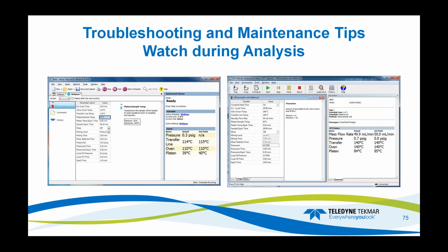Watching during analysis. Now I know some people may say, well, Mr. Roger told me that during the HT3 or Versa run I have to watch it during the analysis. What I'm suggesting here is to kind of keep an eye on it. In my years of laboratory experience, I can walk in the lab and sometimes hear something that's not quite right. As you walk past the instrument through the day, do things look right? Does it sound right? Are the sounds similar? If you become accustomed to that, sometimes you can hear when something doesn't go right.